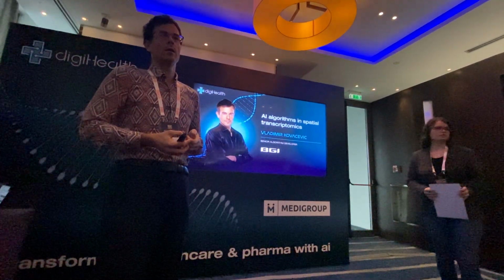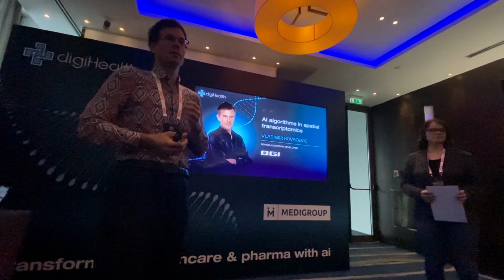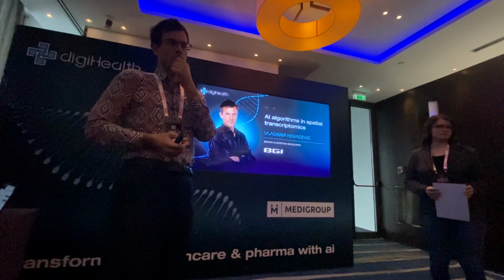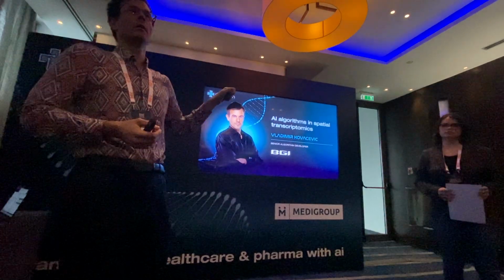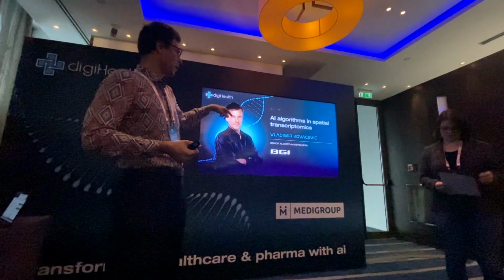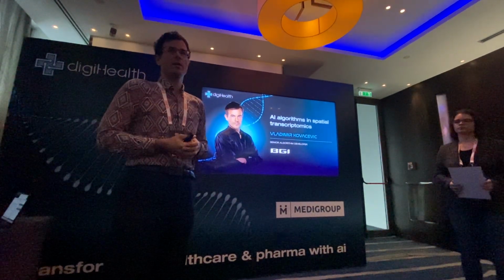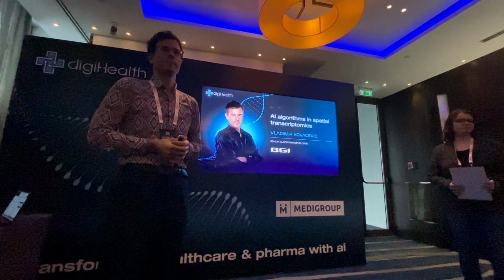How many classes do you have there? Classes depend on the tissue, but let's say from 10 to 50. Okay, I'm asking because you could still put the encoder part, run through all of that, but then just classify without the contrastive loss. You mean to lock it? Yeah, we experimented with different parameters, and we also experimented with allowing a smaller change in the contrastive learning part, and these are all parameters that can be adjusted in the tool.